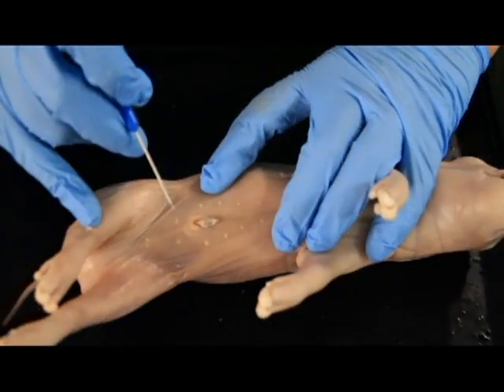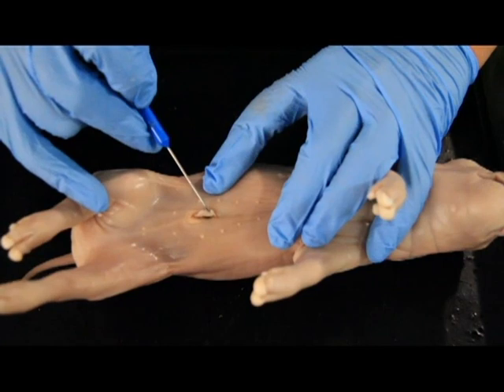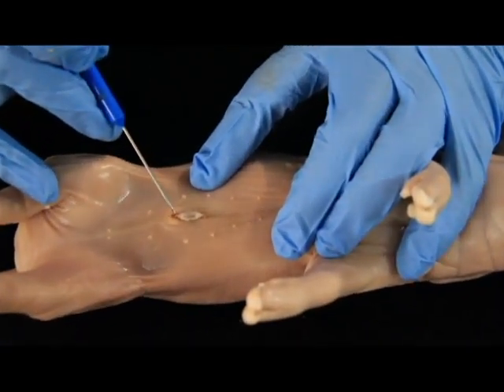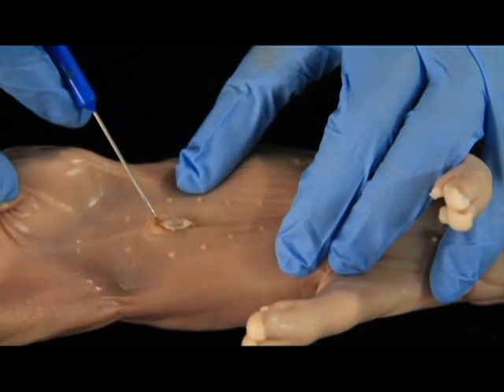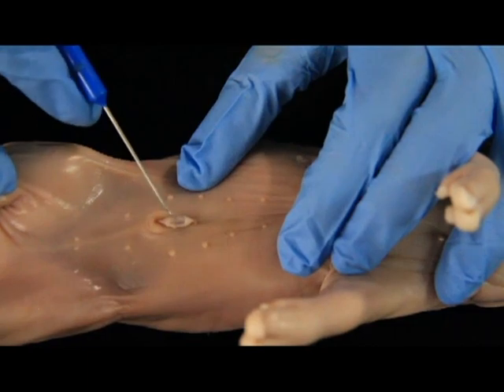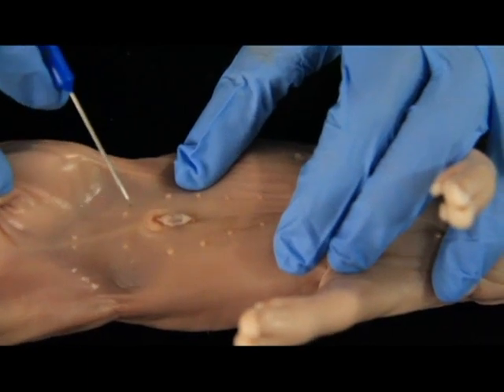So what we want to focus on is this area right here. This is his umbilical cord, and that's where the fetus is attached to the mother. But right below that, right here, this is our urogenital opening. And because this urogenital opening is located just below the umbilical cord, that means he must be a male.